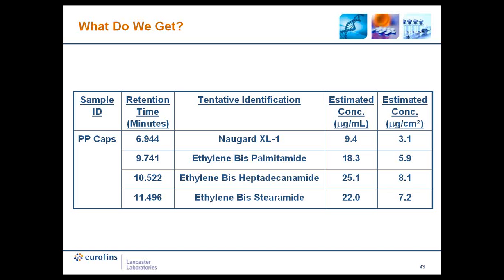After the initial screening or after the simulation study, a toxicological evaluation can be performed. At this time, our colleague, Paolo Pescia, will provide more insight regarding the toxicological evaluation of data.